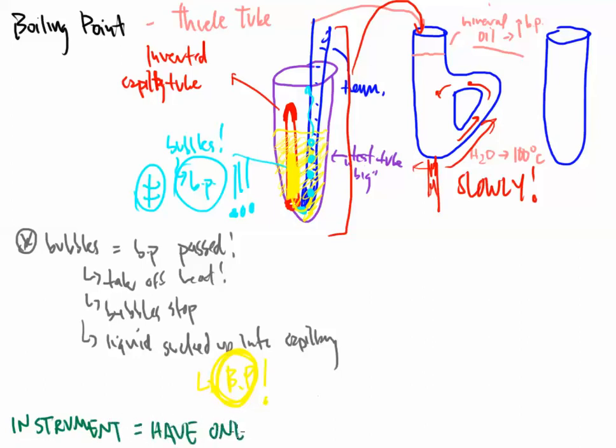We have an automated system, just like melting point, that does boiling point for us. So they're out there. However, we don't have one. So this is going to be something that we might work on in the future and try to get an automated system that does boiling point for me, so that way you can compare your hand measurements to the instrumentation methods. But for now, we do not have that technology in our lab.